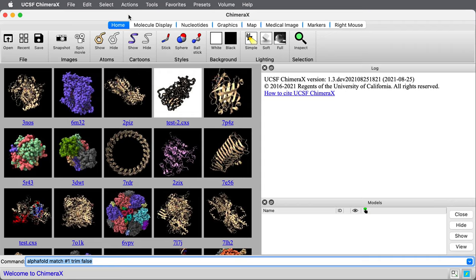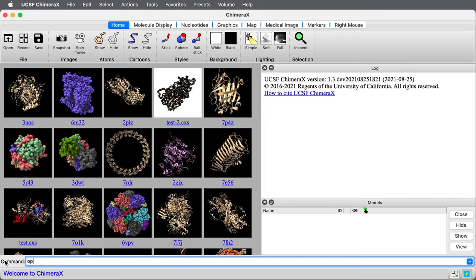Let's take a look at how to compare an experimental protein structure to the same protein structure predicted by the AlphaFold software. We'll look at a nitric oxide synthase structure from human.